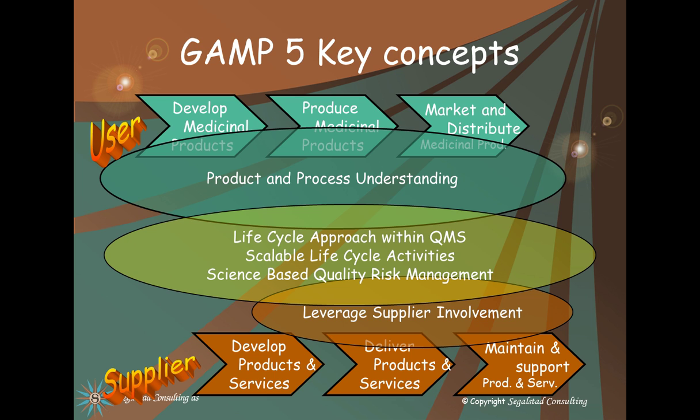Now, GAMP5 has this really large form for describing responsibilities between the supplier and the user. We're not going through this in detail, but please note that you may leverage the supplier involvement. It's close to the bottom there, meaning that you do not have to repeat what he has already done.